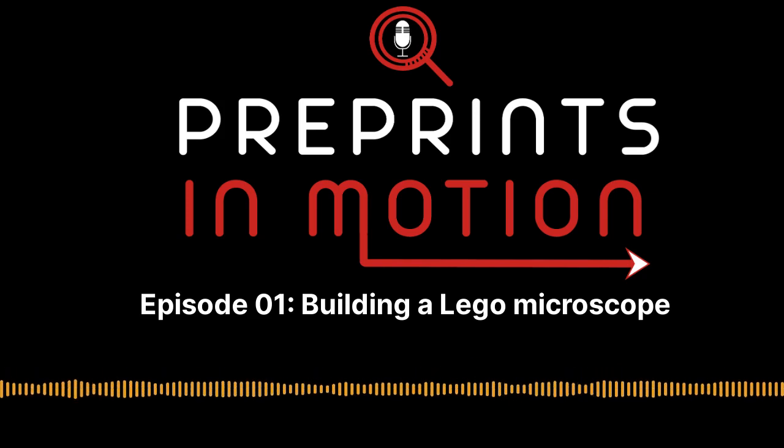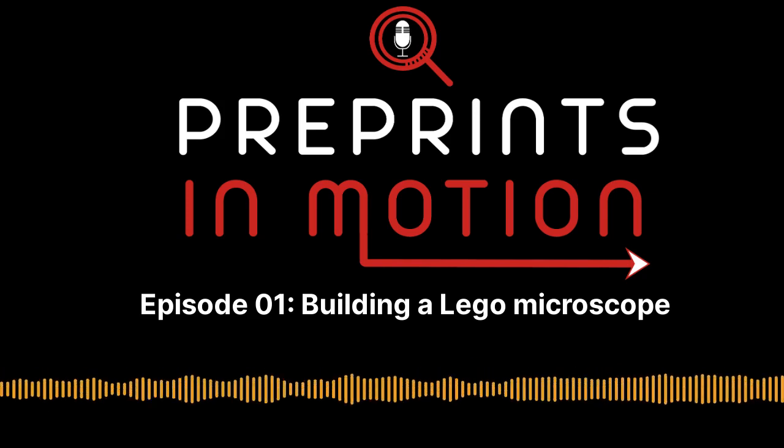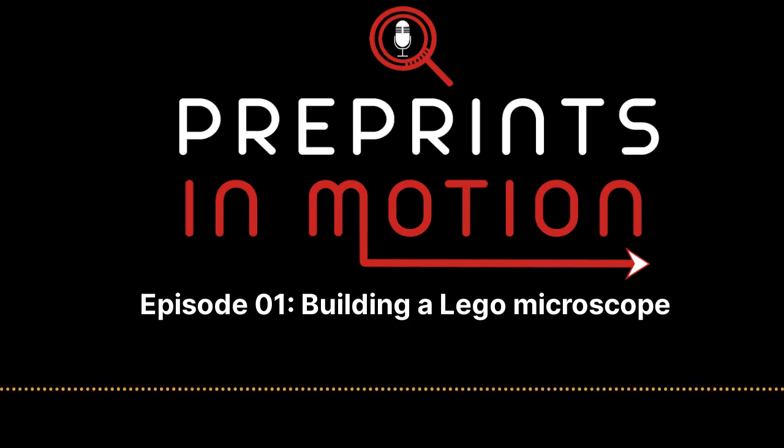And these kind of things are really useful because, yes, okay, you might not be able to do something as complicated as what I did with the light sheet, for example, but you can run fairly sophisticated experiments still. Exactly. Well, it all boils down to recognizing what elements are crucial, what specifications you need, and then building around it to get something that works.